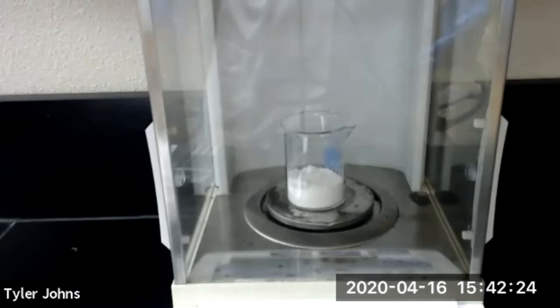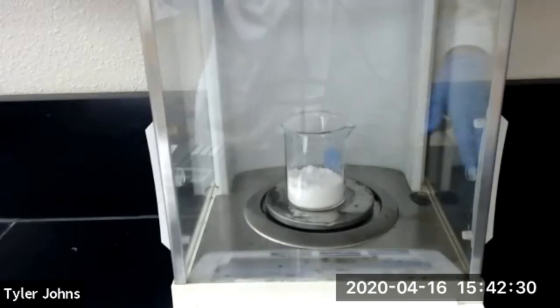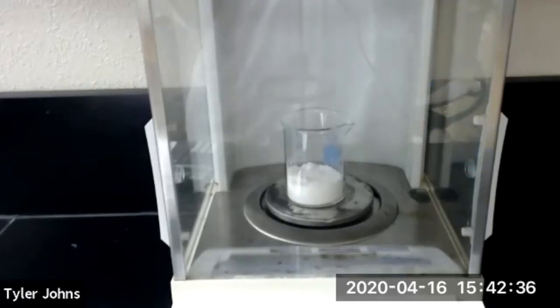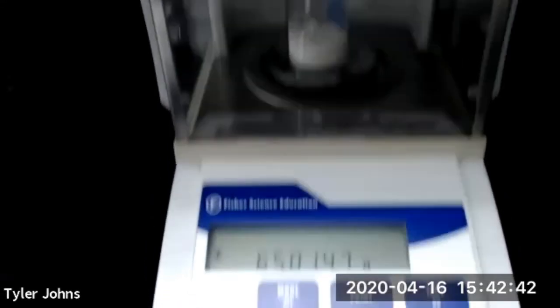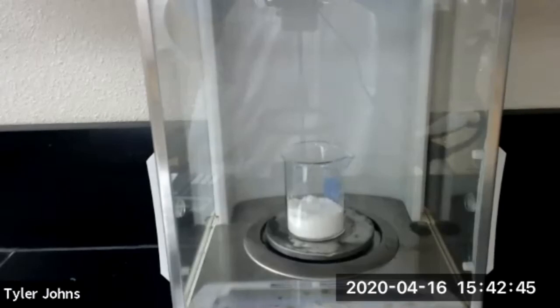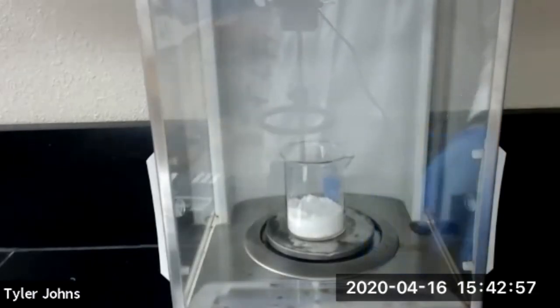We've let our alum dry and transferred it to our pre-weighed 100 mL beaker. Now we're going to determine the mass of the alum plus the pre-weighed 100 mL beaker. The mass of the alum plus the pre-weighed 100 mL beaker is 65.0147 grams. That concludes our preparation of alum experiment. Thank you for joining me for this laboratory period.